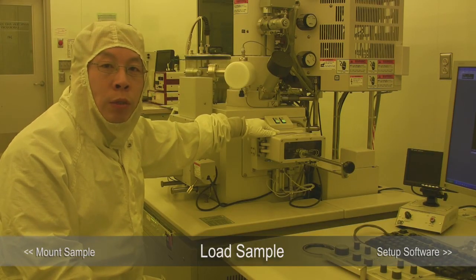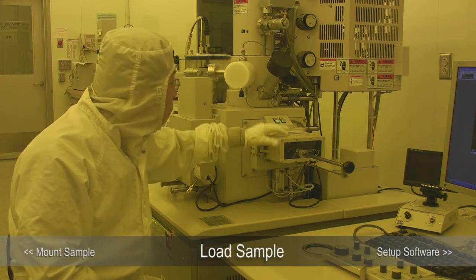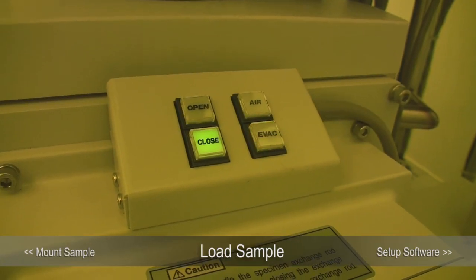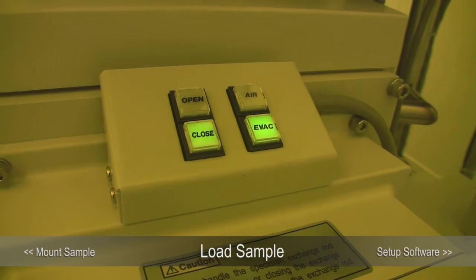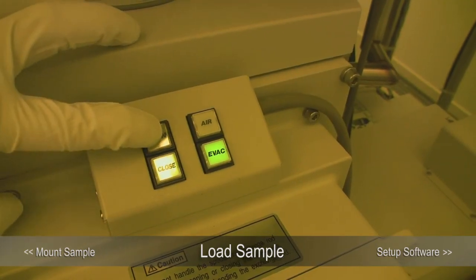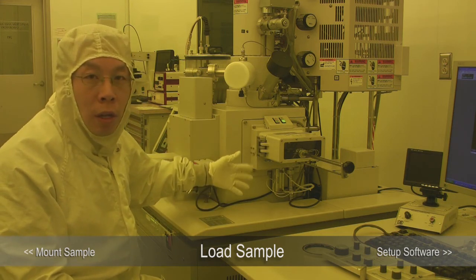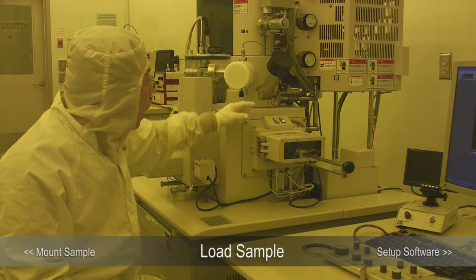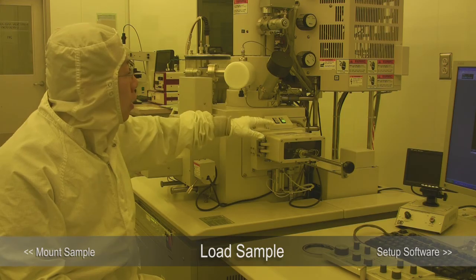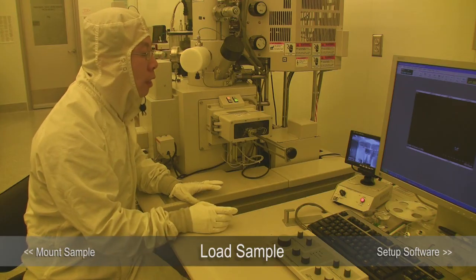Usually it takes a few seconds to pump down. When the pressure is low enough in the load lock, the evacuation button will stop flashing and you will hear a beep sound. The next step is to press open. When pressed, it takes a while to actually open the door — it's checking the pressure. Once again, wait until it stops flashing and you hear the beep sound, then you will know the load lock door is open and you're ready to load the sample.